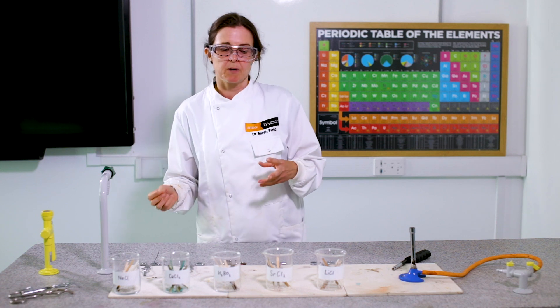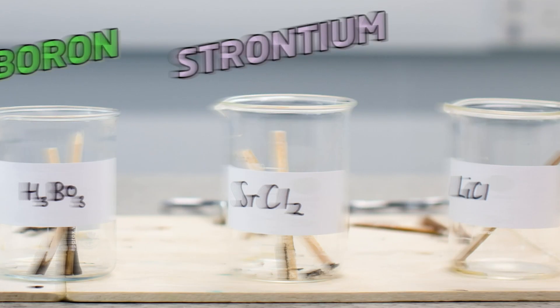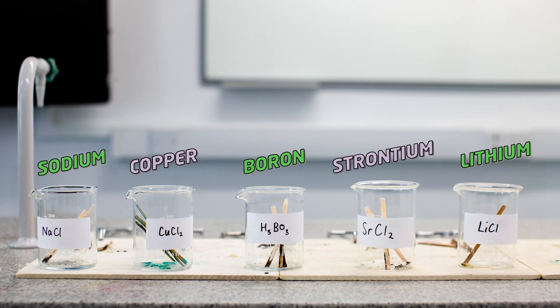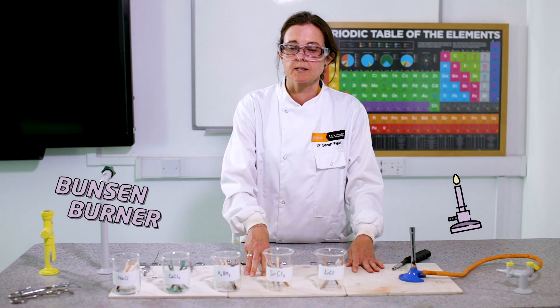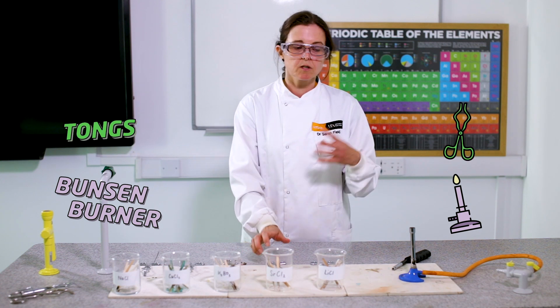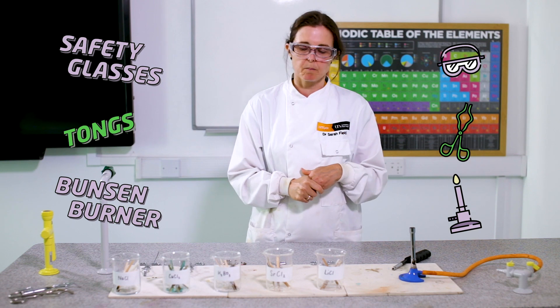Today we're going to look at the rainbow flame experiment. We've got five different metals: sodium, copper, boron, strontium, and lithium, and we're going to heat them up and they're going to give us different colors. I'm going to use a Bunsen burner to heat them, heatproof mats to protect the bench, tongs so I don't put my fingers in the flame, and safety glasses in case there are any sparks to protect my eyes.